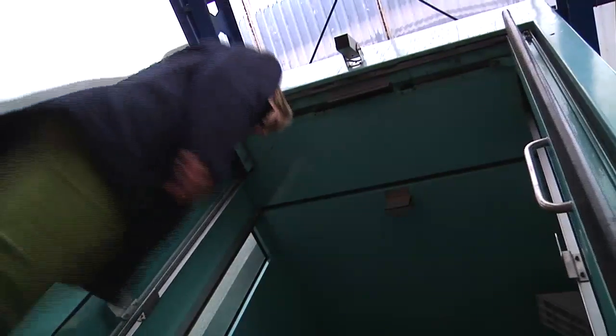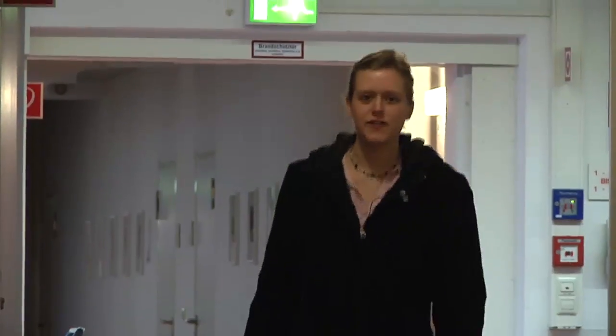I'm Jenny. Today I'm visiting the State Institute for Chemical and Veterinary Analysis of Food in Freiburg. I will be meeting Ulrich Weiblinger and Mirjam Schillinger. The institute analyzes food for traces of genetically modified plants. I would like to find out today what method they use and how the analysis works.